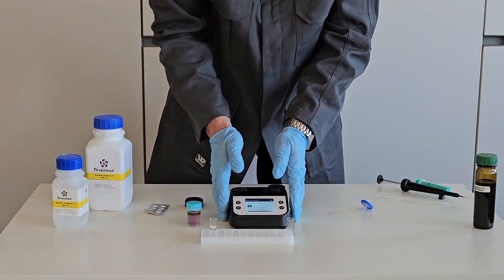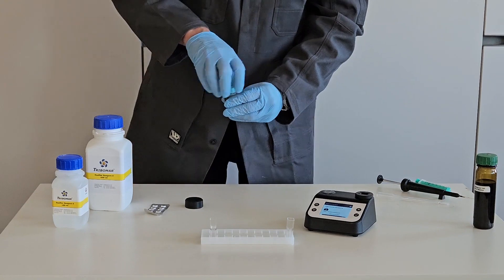For this, use a 3 ml syringe to fill in the colored water phase of the sample.